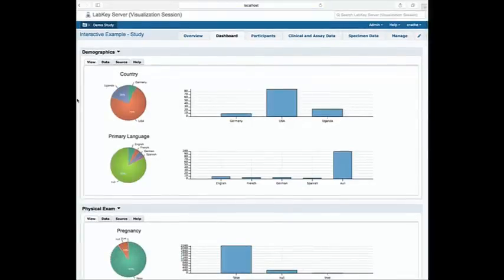And in the LabKey data set, you can define columns as dimensions or measures. It helps with some of the plotting tools to make decisions about what types of default selections we're going to make. In this case, I chose that all of the ones that are marked as dimensions, I'm going to plot using pie charts and bar charts. So to Catherine's point earlier, I'm glad I didn't just use pie charts, because bar charts might be easier to compare, but I added both here, so that's good.